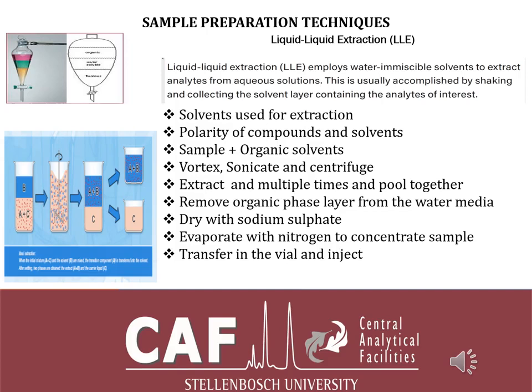Liquid extraction: if some of you have done chemistry from level 1 until you finished, you'll remember when we were just starting, we were doing some extraction where we were shaking, and we were just doing it because we were fascinated. We didn't really know what we were doing and how important that is. If you look at the top left corner, you'll see there's a separating funnel and some colors. I guess it brings up some memories, without giving away your age, of course.